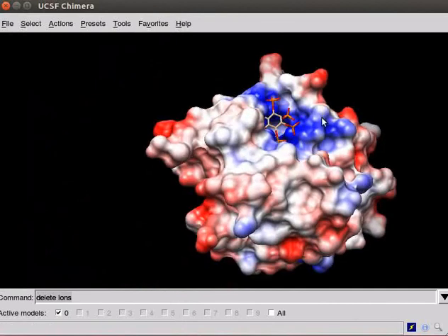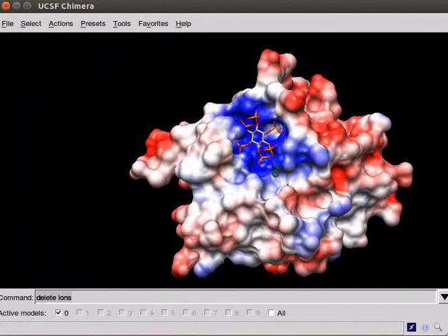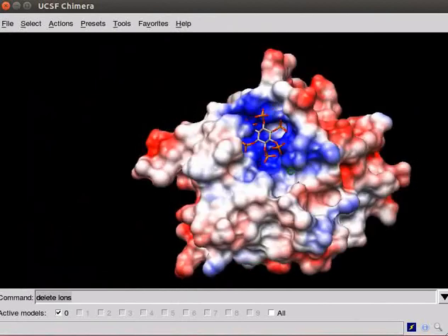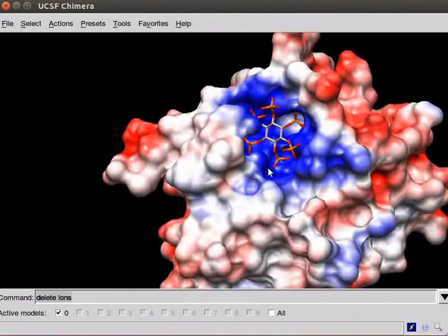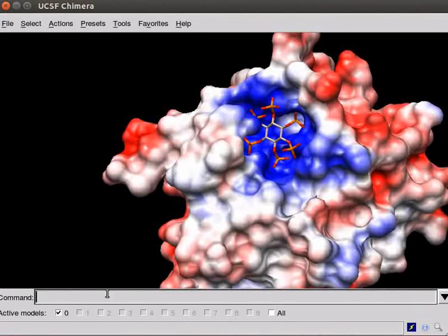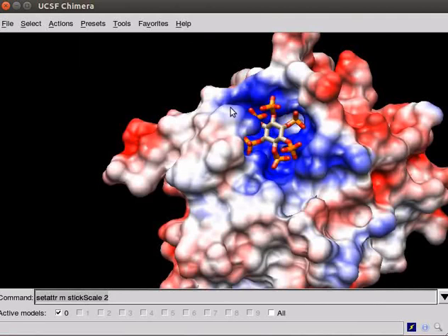Now, let's see how to create high quality images for publication, presentations, etc. Make the sticks of the inositol ligand a little thicker using the command set attribute setatttr space m space stick scale space 2. Press enter.